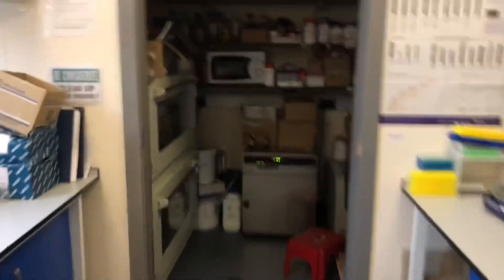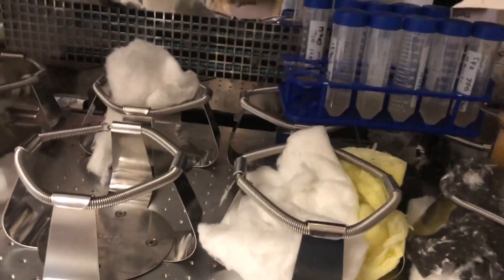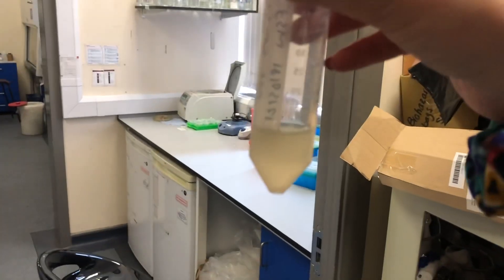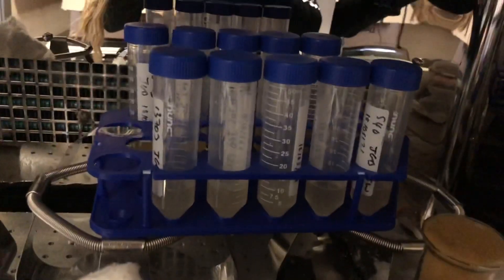Have my bacteria grown? Moment of truth. I think it worked!